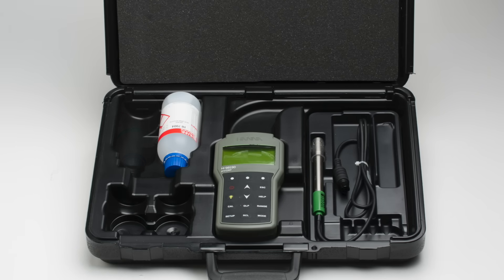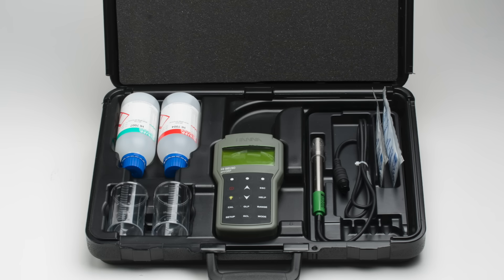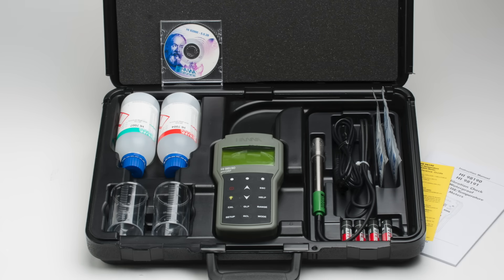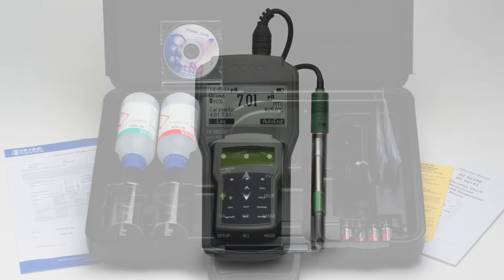A bottle of pH 4 buffer, a bottle of pH 7 buffer, two sachets of general purpose cleaning solution, two plastic beakers, four AA batteries, Windows-compatible PC software, a micro USB cable, an instruction manual with quick start guide, and the instrument quality certificate.